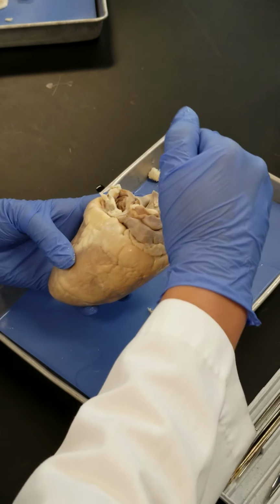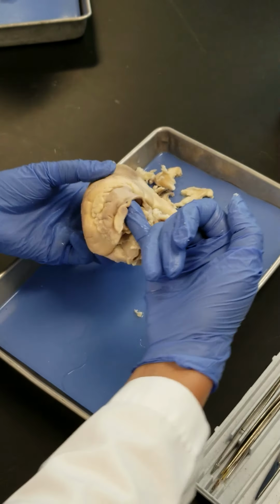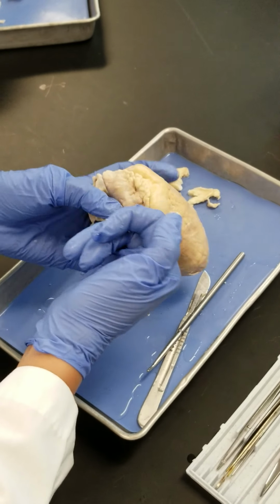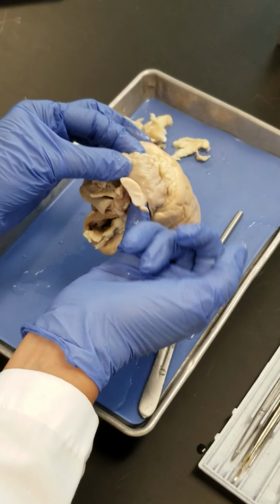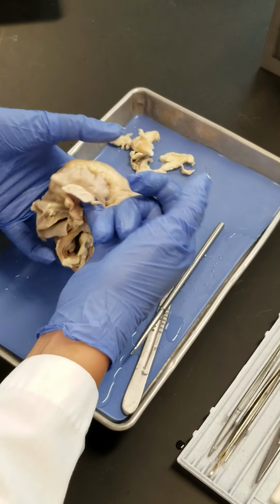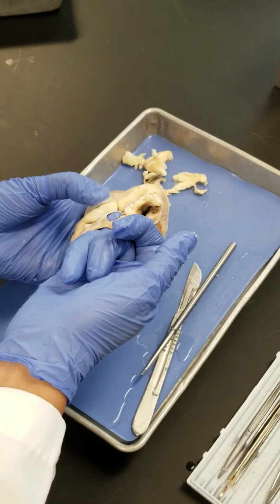Put your finger into this cavity. This is the right atrium, and remember, you can open the auricle here. You see how the auricle can get separated, both sides of the auricle, and can accommodate more blood when it is needed, right? So go around and search if you can find another opening here.